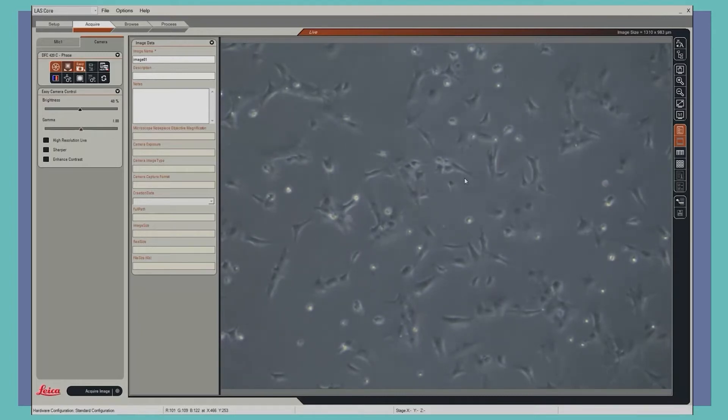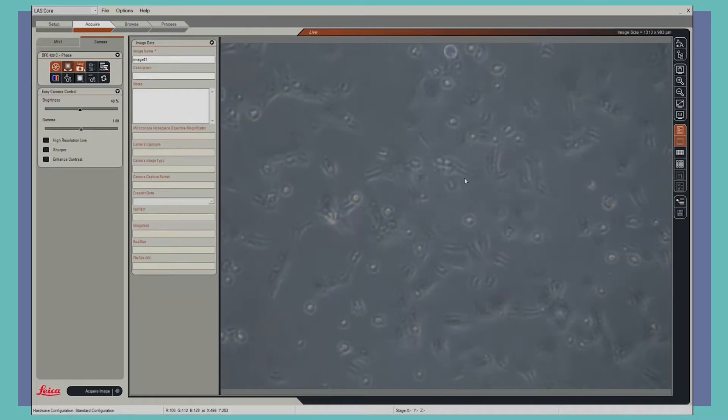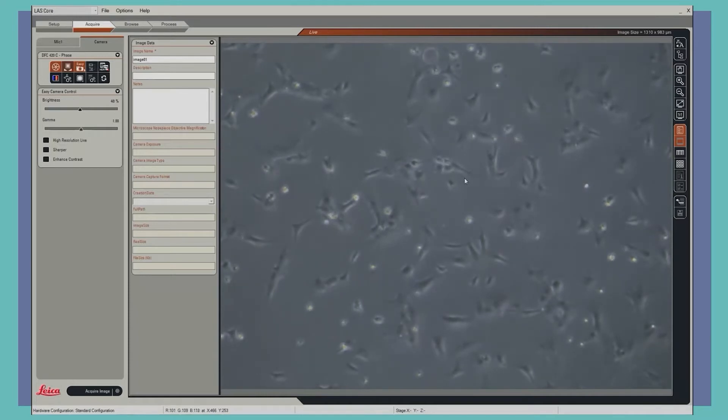First we want to acquire the sharpest image possible of our cells. We do this by adjusting the coarse focus knob on the microscope itself. As we bring the cells out of focus, we can see the image becomes blurry, and we can quickly bring it back into focus, acquiring a much sharper image of our cells.